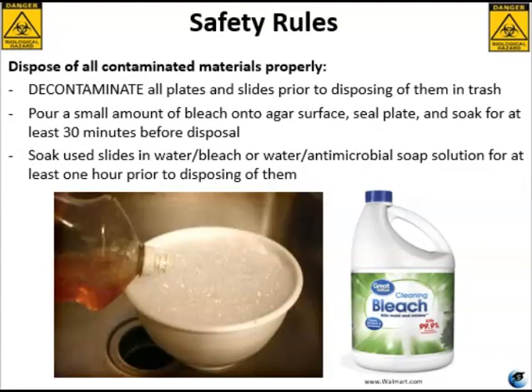And finally, we'll talk about disposing of things. So after you use your plates and your slides, you'll have to dispose of them properly so you're not endangering yourself or the environment or anything like that. The key here is to decontaminate items before you dispose of them. As long as you're not collecting samples from the bathroom, okay, where there's definitely pathogenic bacteria, it should be safe to decontaminate and dispose of the specimen plates and the slides at home in your regular garbage.